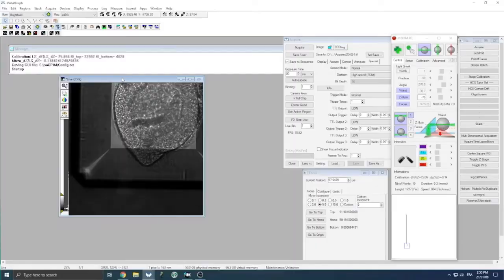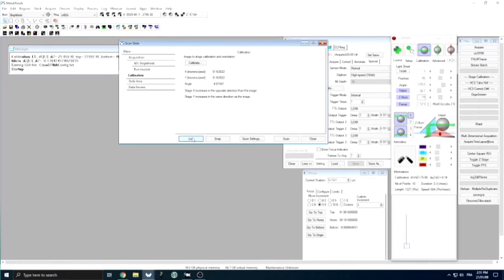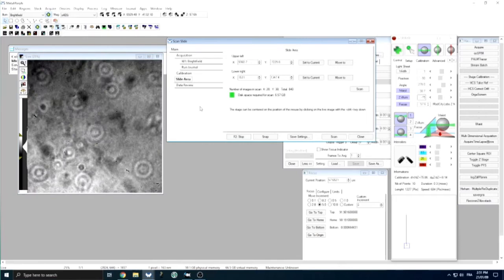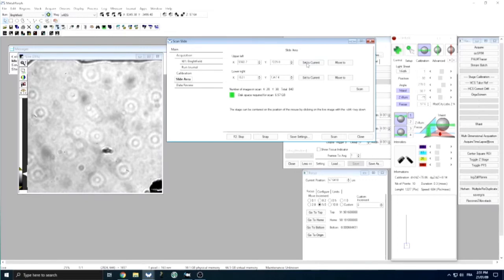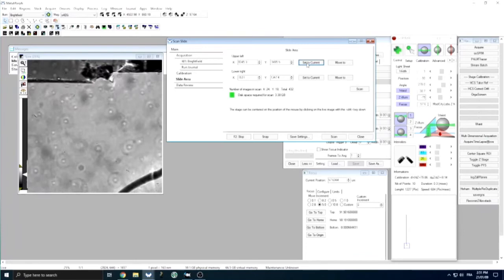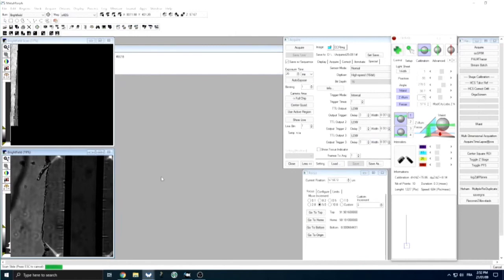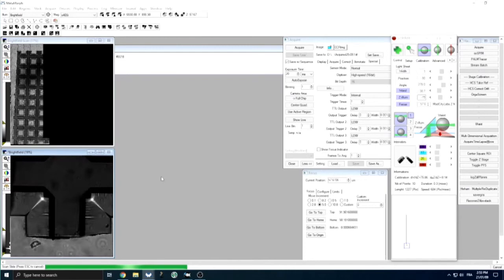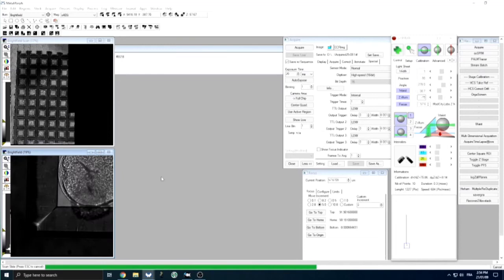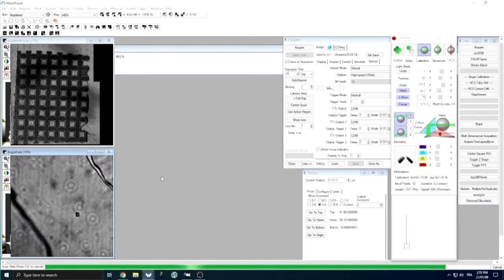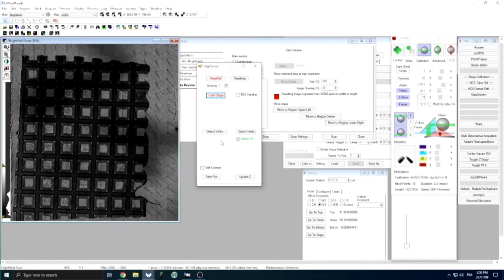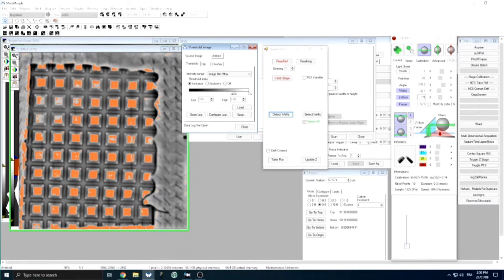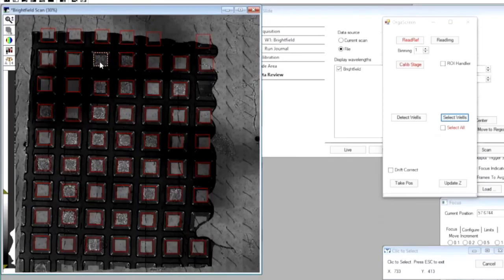To set up a multi-position timelapse acquisition, we first acquire an image of the whole device in brightfield using the scan slide tool of Metamorph. After calibrating the stage axis according to the camera field of view, we define the upper left and lower right corners of the field we want to acquire, making sure to encompass the whole well array to get an image of all the G-wells present in our device. We then launch a scan slide acquisition — with the video speed increased 20×, it takes around 20 minutes to acquire our 8×8 mm field of view with our 60× objective. We developed an automatic detection tool of all G-wells present on the scan slide image based on basic filtering and threshold adjustment. Once all G-wells are detected, we can select or unselect the ones we want to image by clicking on the corresponding region of interest on our scan slide image.